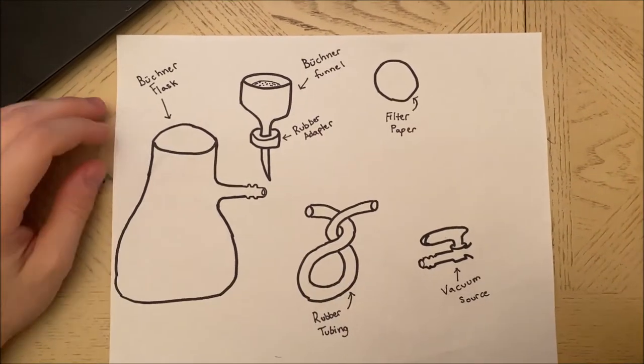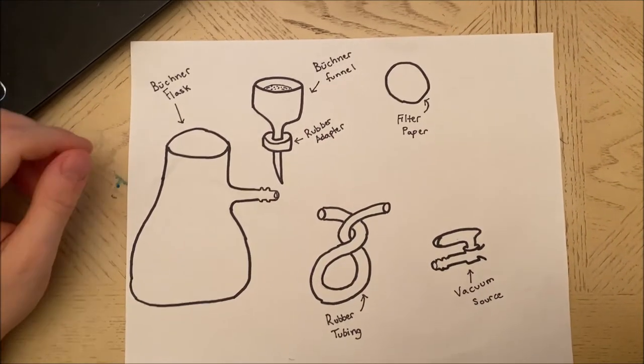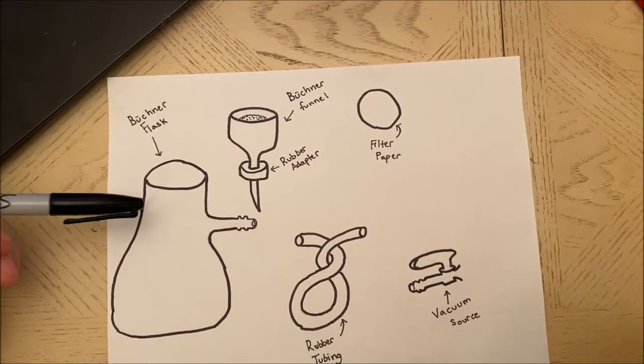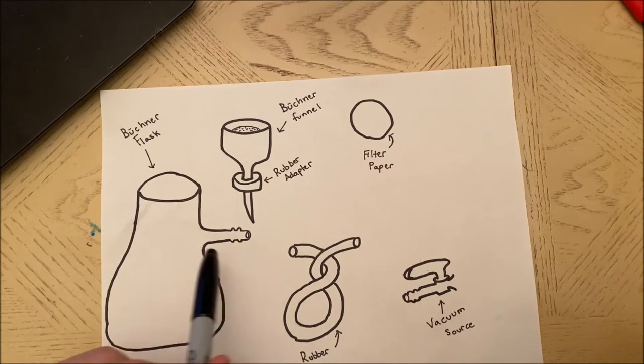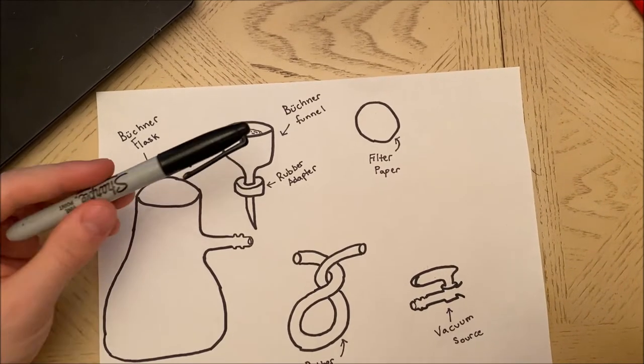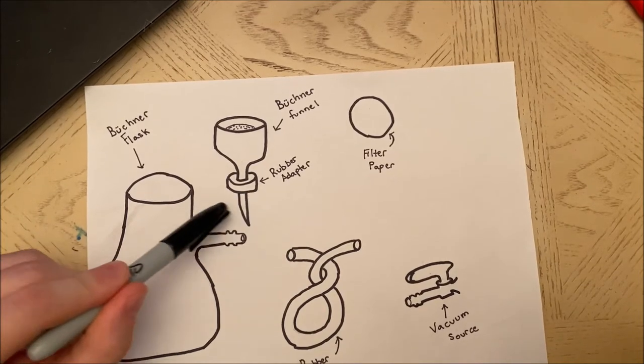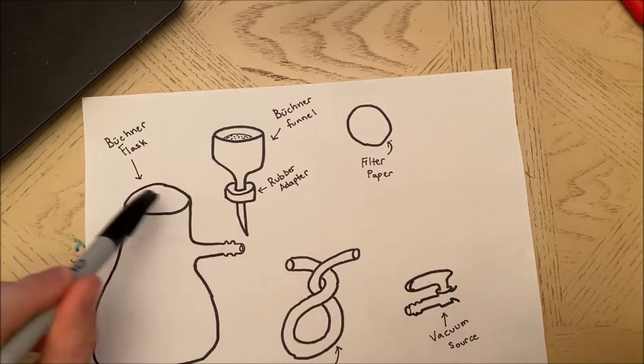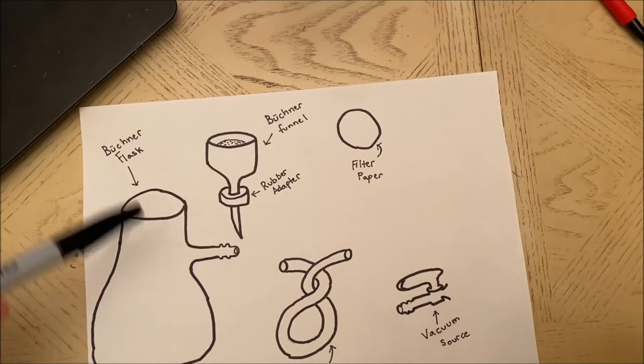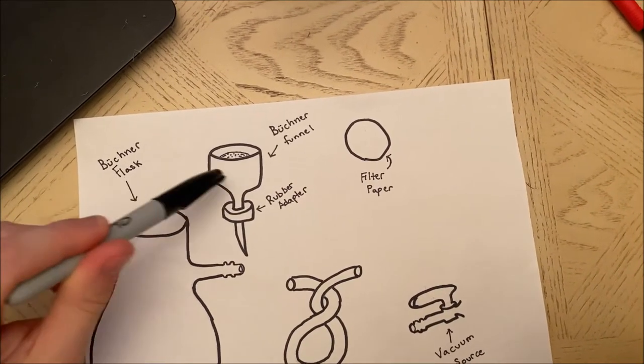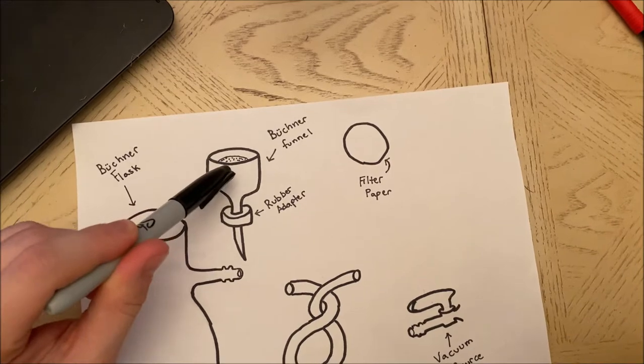The things that we need for vacuum filtration are here on this paper. First thing we need is a Buchner flask with a sidearm. We need a Buchner funnel that has a rubber adapter so that it'll keep everything sealed airtight and nothing will escape the flask. Make sure that the Buchner funnel has holes in it to allow the liquid to pass through.